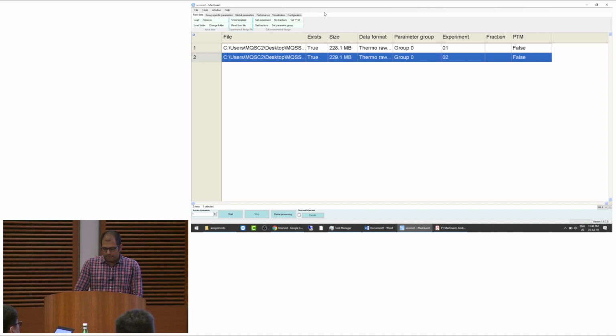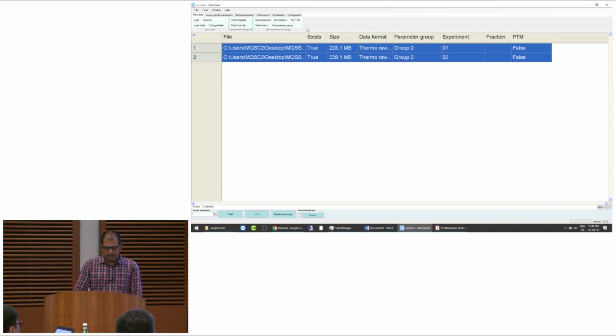Right, so let's say I did all the other settings, but I forgot to put the experiment names, and then I started the run and it finished. What actually happens? It's all in one thing. But then you don't have to completely start from the beginning. I will show you later how to do that. So for now, no fractions. I keep it 1, 2 because it's less than 10 samples, so it doesn't really matter.